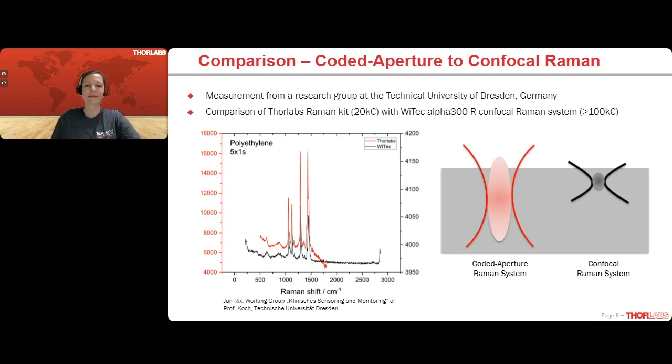On a similar note, would the technique be compatible with surface-enhanced Raman spectroscopy? That's also a very good question. So yes, we have tested SERS to be compatible with our systems. I cannot show you results yet, but we have tested it successfully and we get an enhancement of the signal. So if you have a certain application, we can certainly look into that in more detail.